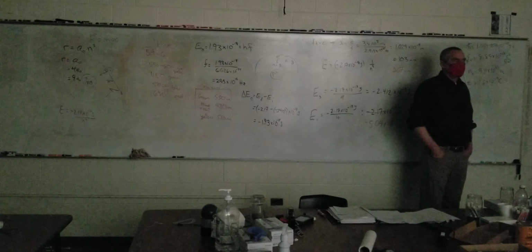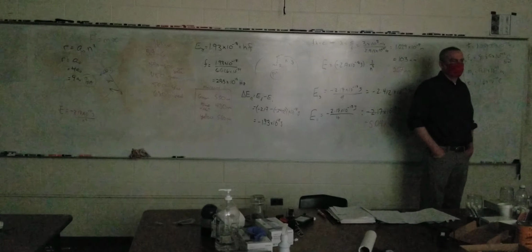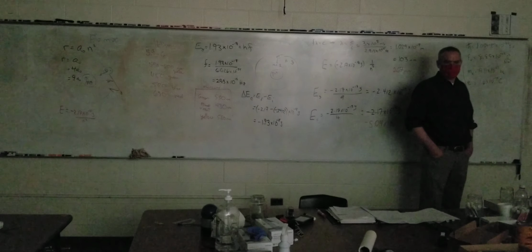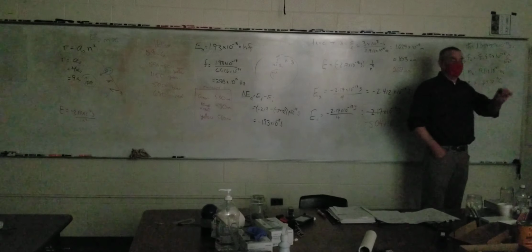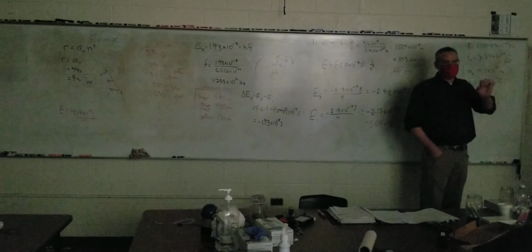This one also is labeled as mercury. What? That one? HG is mercury, right? Yes. So the labels on the tubes are accurate, I believe. Sorry, the label on the glass tube is accurate. The labels on the cardboard tubes are not.